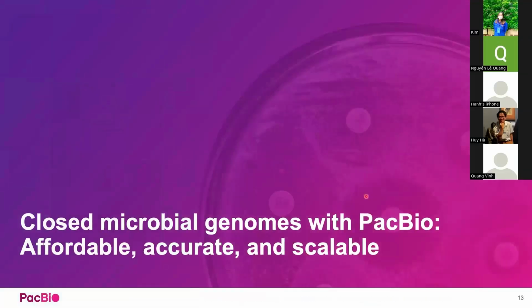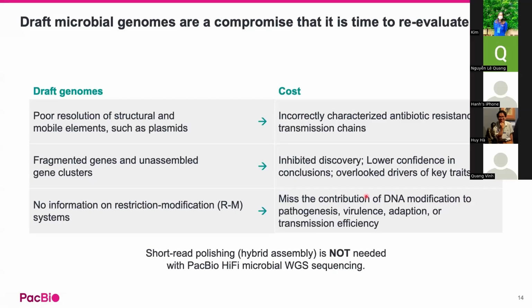Okay, so next we will go into the different applications to further elaborate on the four different applications that I described earlier. The first one is of course microbial whole genome sequencing. I think currently most of the whole genome sequencing for microbes is still being performed with short read sequences, right, to produce a draft genome. Usually these draft genomes will have a few disadvantages.